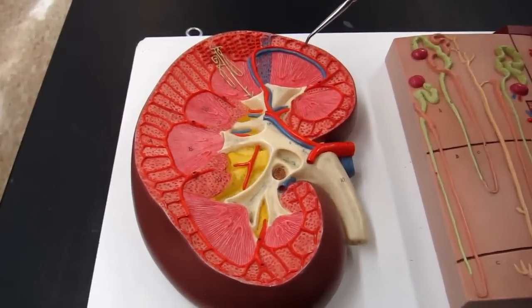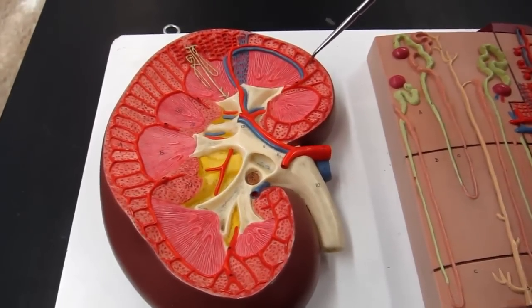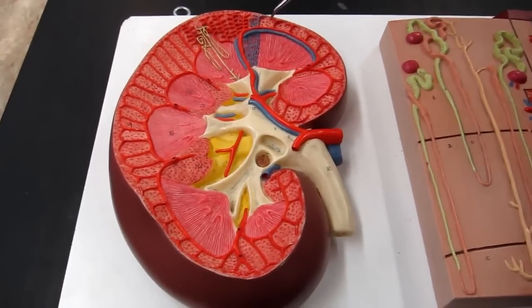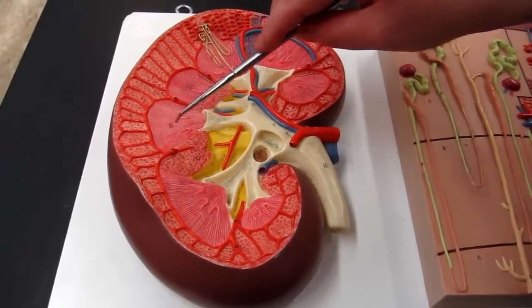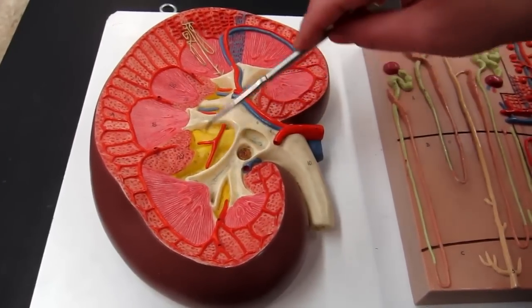And you can also see the cortical radiate arteries branching off of the arcuate artery and radiating into the cortex, which is where they get their name from. Okay, the pyramids, a whole bunch of those. Each pyramid has a minor calyx.